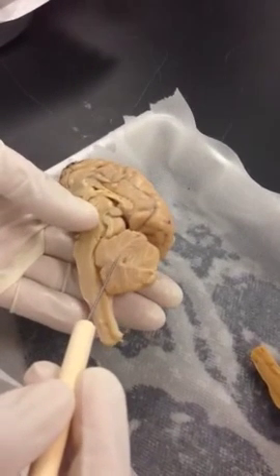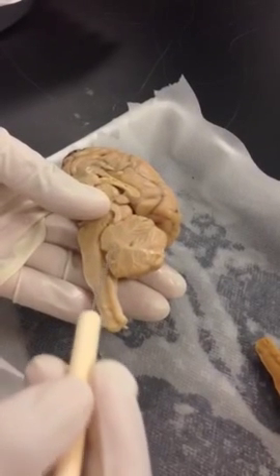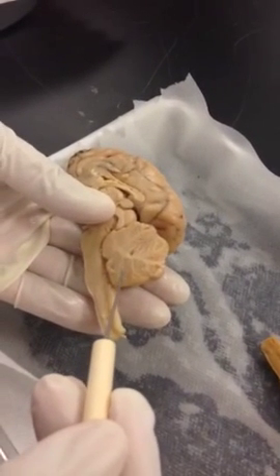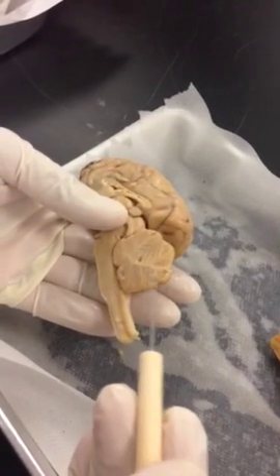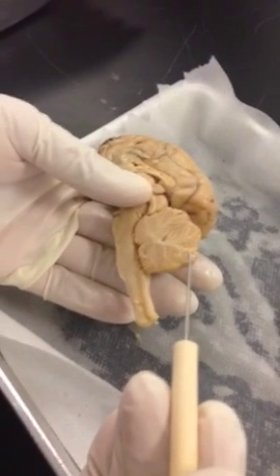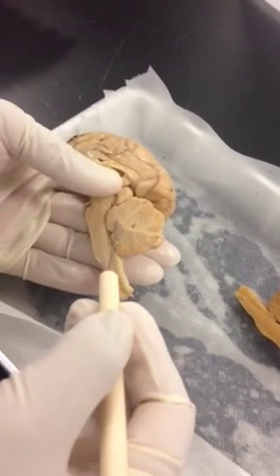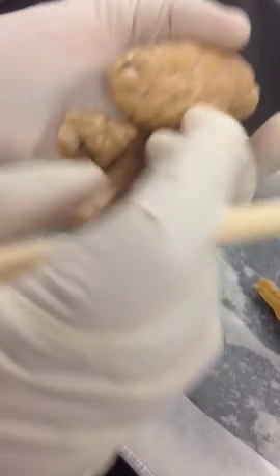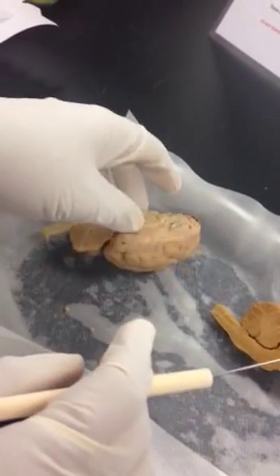So if you see in the middle of the cerebellum, you have this tree-like branching structure. They call it arbor vitae. Arbor, arboretum, trees. Vitae means life. They call it tree of life, but we need to use the word arbor vitae. Okay. And that's good for the cerebellum.